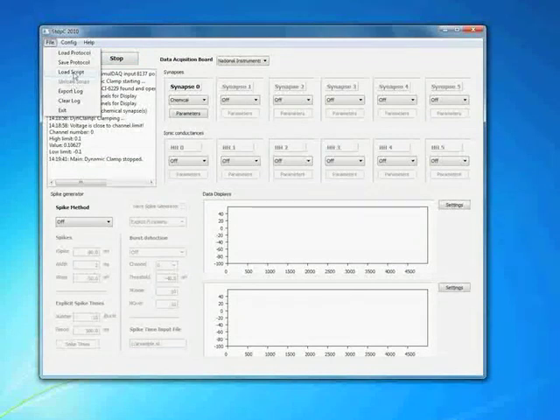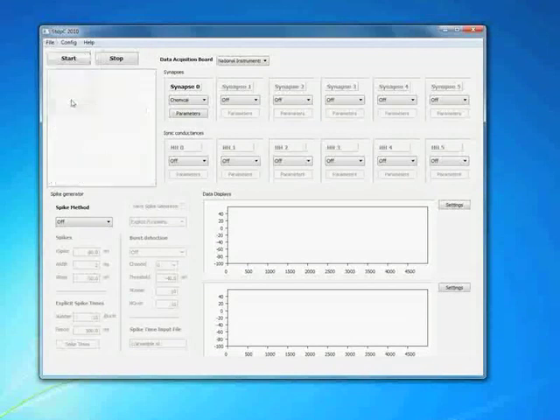This is a functionality that allows you to change parameters during runtime at certain pre-specified times. And the other one is to export the log that you just saw in that message window, or to clear it. I'll choose clear here, so you see the effect, and then I'll exit the program. And this completes this demo.